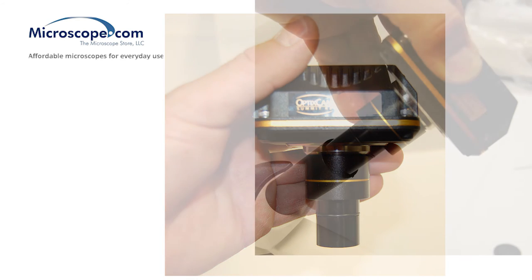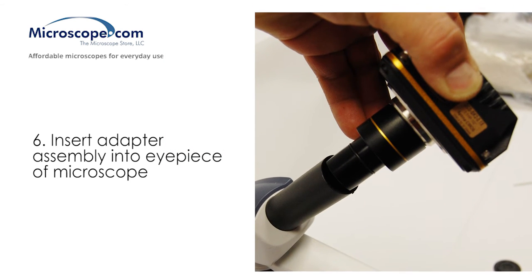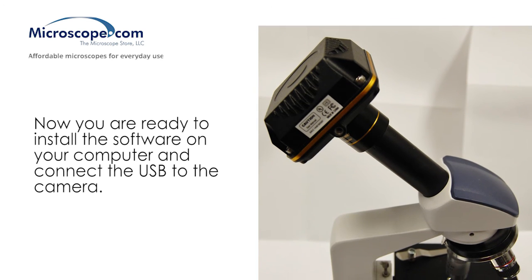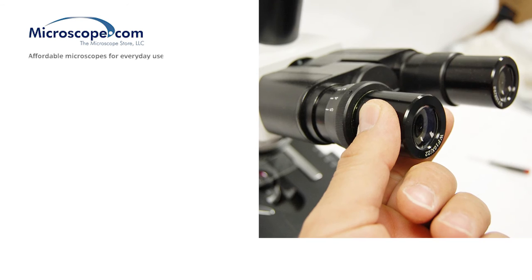Slide the camera and adapter assembly into the eye tube of the microscope, or into the open trinocular port on top of the microscope if one is present. Now you are ready to install the software on your computer, and then connect the USB cable to the camera.